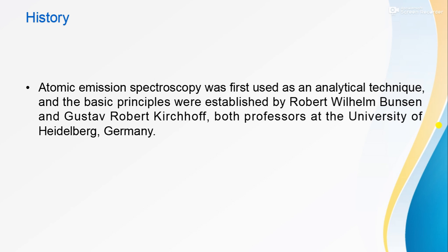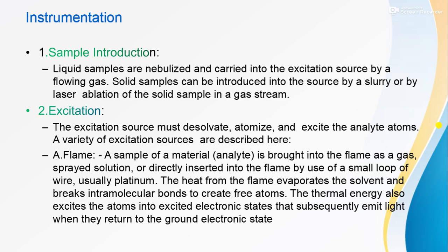History. Atomic emission spectroscopy was first used as an analytical technique, and the basic principles were established by Robert Wilhelm Bunsen and Gustav Robert Kirchhoff, both professors at the University of Heidelberg, Germany.